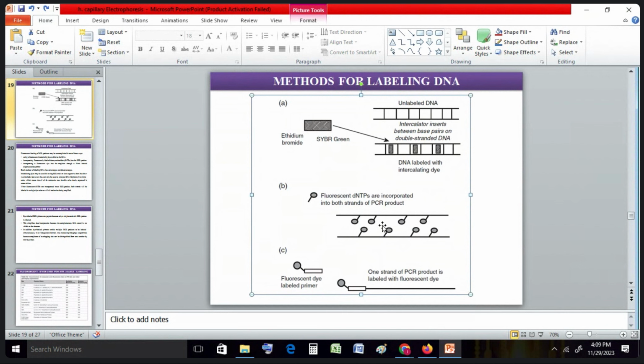If it is the same size, then it is different, it is difficult. Then the last method is the best method. I will discuss this later, but you should consider all these things beforehand. You have to consider everything. If it is the same size, you can exclude those PCRs which are the same size. Or if you don't have any other option, you have to use this PCR and it will produce the same size, then you can think of the last one, which I will show now.